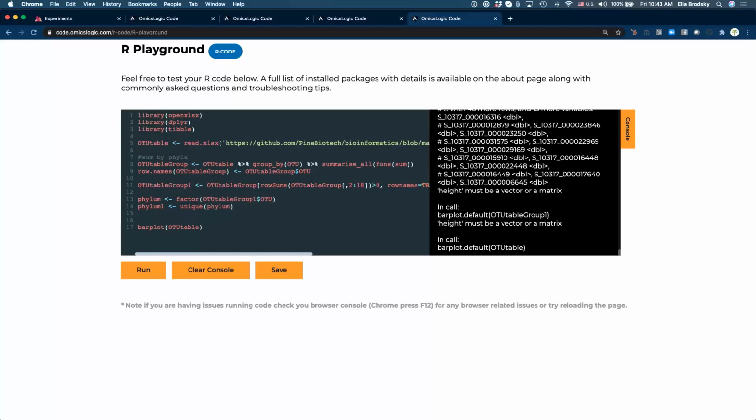So for example, if we want to take OTU table, we need to convert it to a table, removing, so let's do this, OTU table 1, and that's going to be table, OTU table, and then just take the first column, right? So this right here will give us any sample that we want.